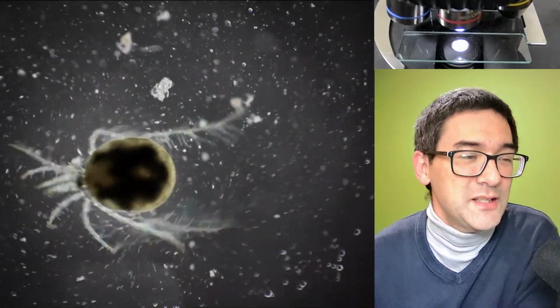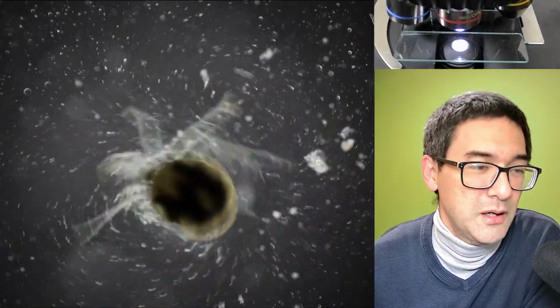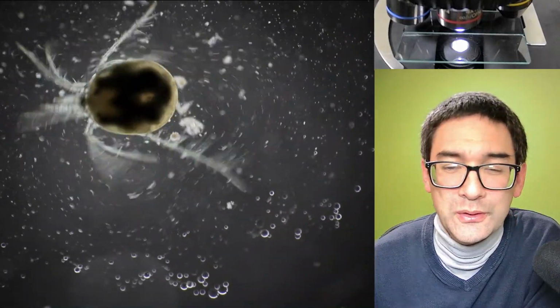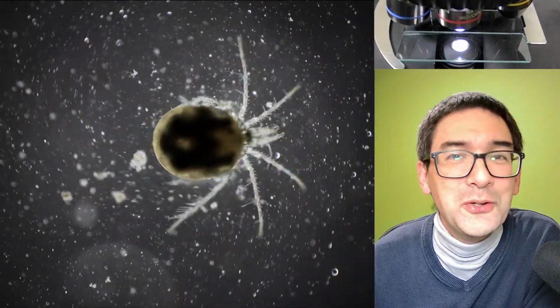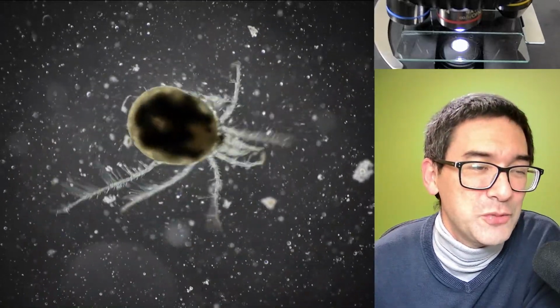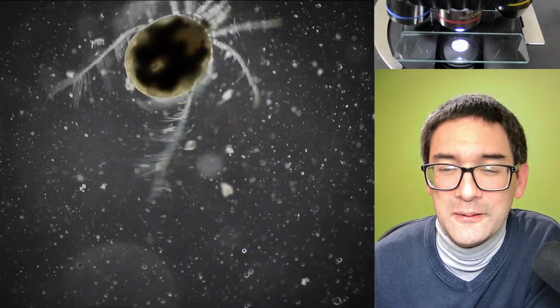So that is actually a nice specimen again. Some mite, which I have to check my identification book, hoping that it can be found in my identification book. But then again, there are so many of them that chances are also pretty good that the organisms that you see under the microscope cannot be found in an identification book. Because biodiversity, as I always say, is quite high.